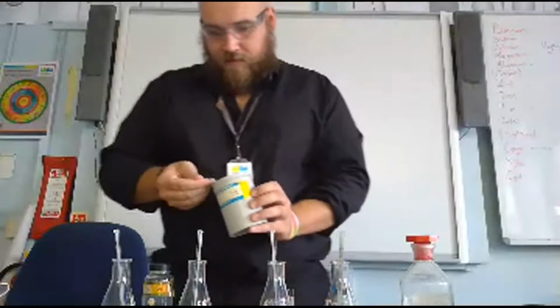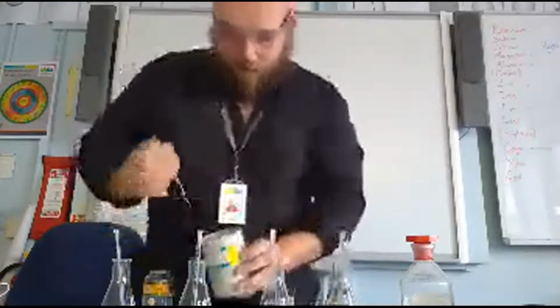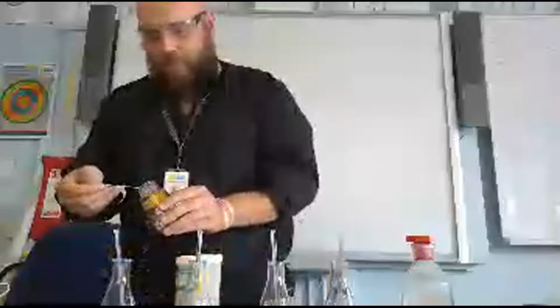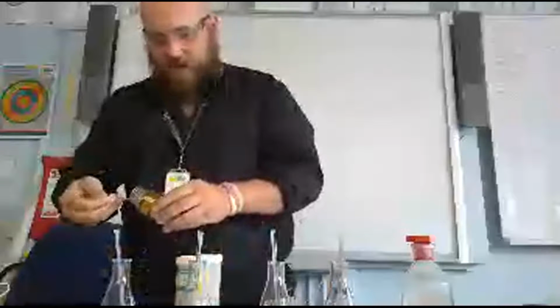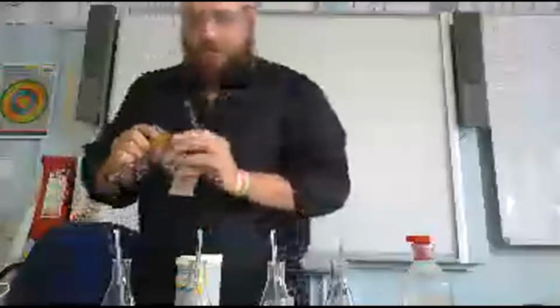So this is my zinc, maybe a bit more, and the final one is tin. And this is actually the only time I'll allow you to say this, because it's actually what it says. This is tin foil, yeah, not the stuff you get from supermarkets, which is aluminium foil.